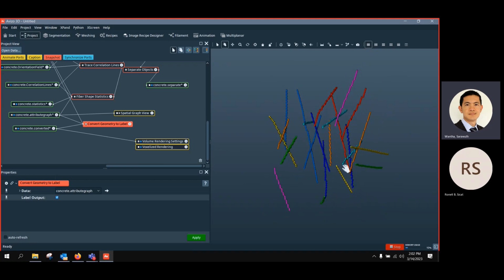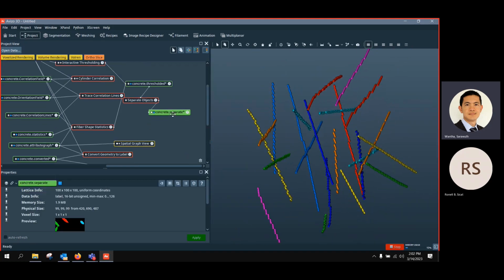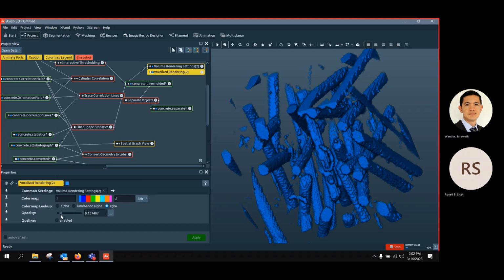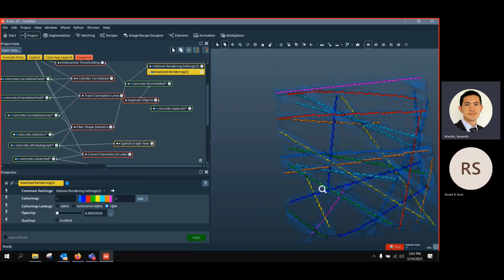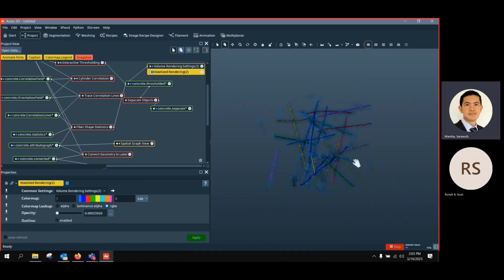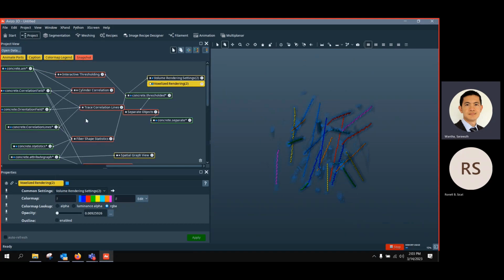And now you can see that I can use this label image as markers for watershed segmentation of the binary mask that we created previously. So I hope you can imagine how it's going to work. Here you can see the binary mask we created as the mask, and the label image that we are going to use as markers for the watershed segmentation. And now we are ready to run watershed segmentation inside the mask.